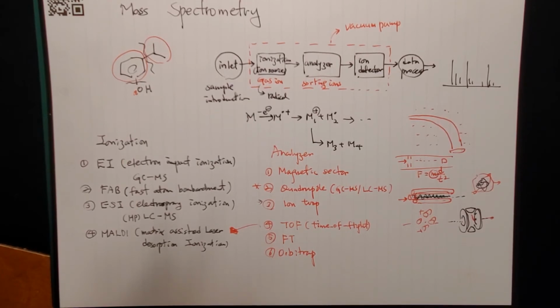So you needed superconductive magnets. But now they have developed the Orbitrap. You don't need such a high-power magnet, and you can do the same thing. So much advance is made here as well. Now we have really excellent equipment in the lab.